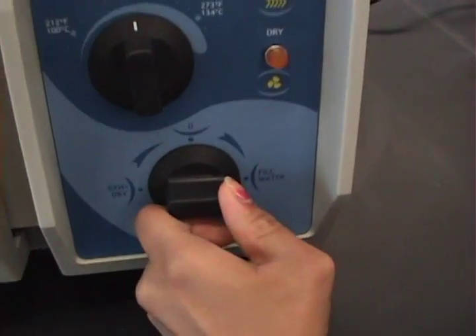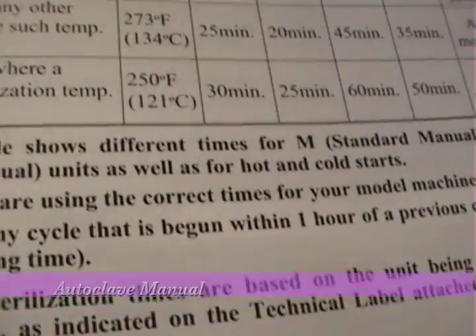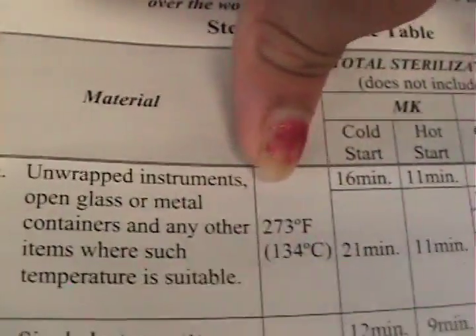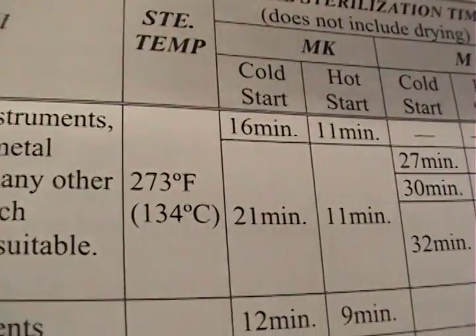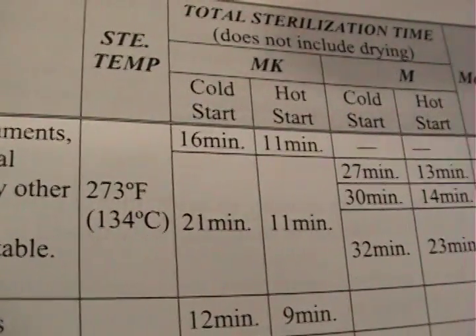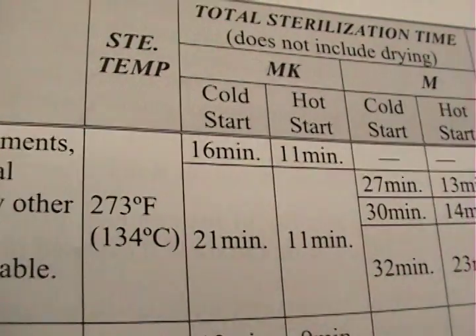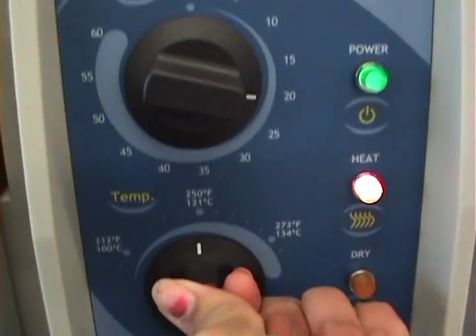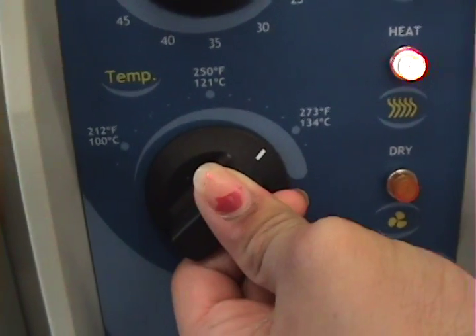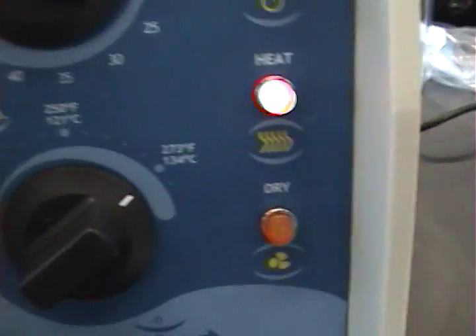Move the bottom knob to sterilize. Refer to page 27 for temperature and time. As you can see, unwrapped instruments such as glass or beakers will be in there at 273°F for 21 minutes. Turn the knob to 21 minutes and the temperature knob to 273, and make sure that your heat light is on.